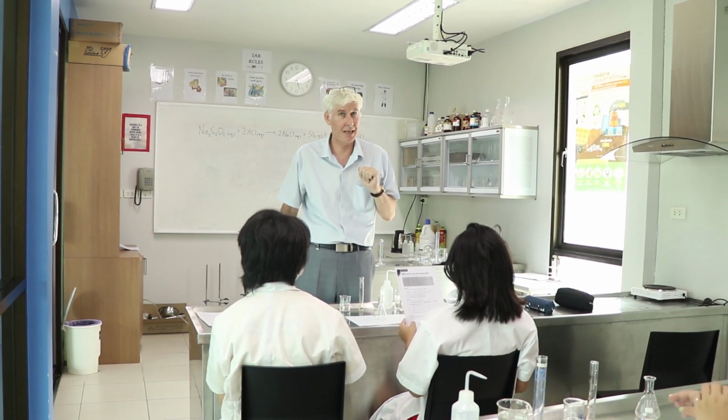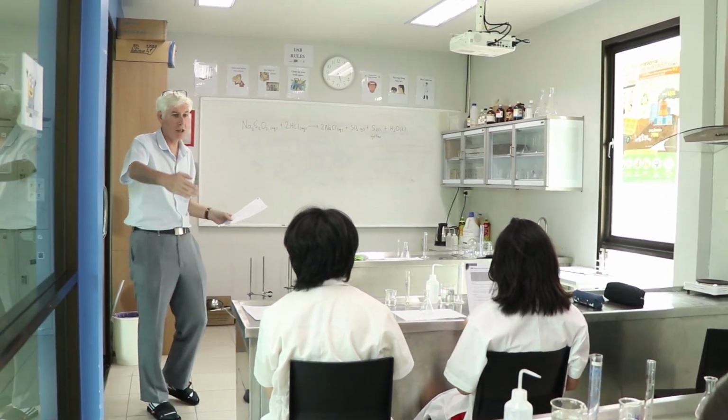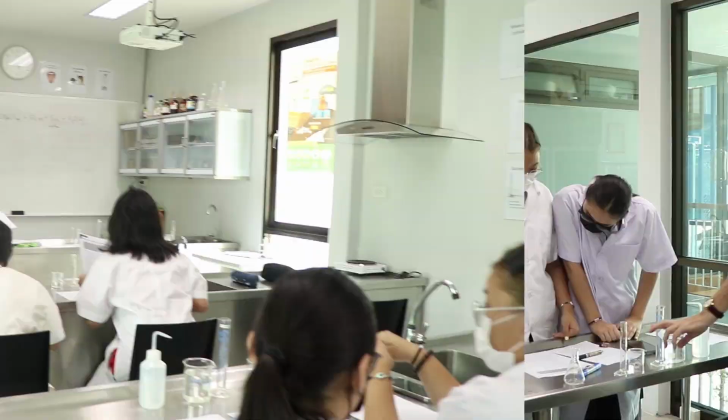Alright, go for it. Move your chairs back, stand up when you do an experiment.